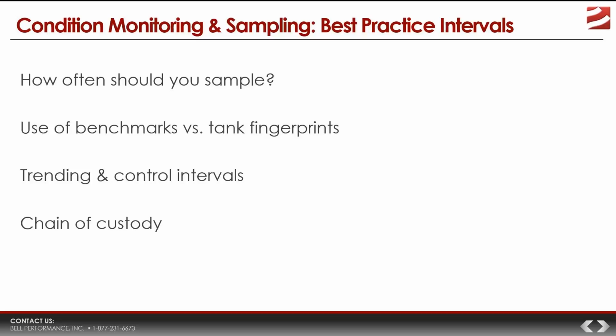And you start to see trends develop that show you at what points in time your microbe levels tend to rise above your cutoff for action, your cutoff to do something about them. And as you develop these trends, you start to see that those points in time, where your microbe levels have risen above your cutoff for action, that's your control interval.